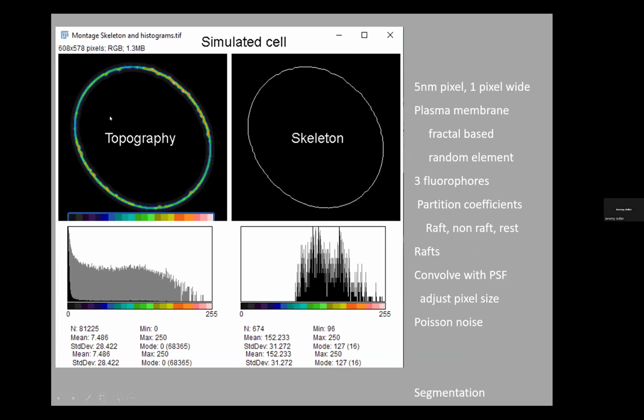Here's one of our many fake simulated cells that we've been playing with. If we look at the range of intensities, the amount of membrane present, we can see there's quite a big range. One way of minimizing this, at least a bit, is to take this, threshold it, reduce it to a skeleton so that we have the midline of the membrane and use those pixels. This is better, but it isn't a perfect solution. This is simply a ridiculously complex way of simulating these cells.